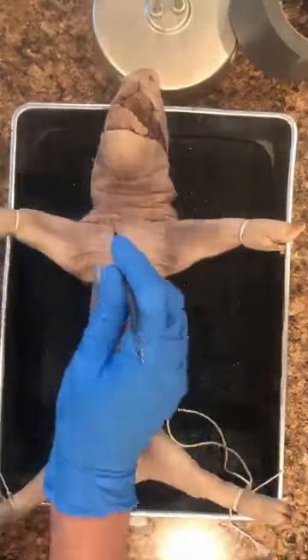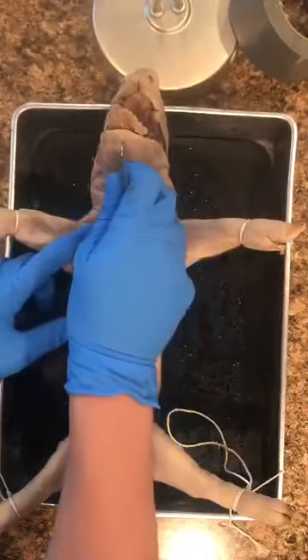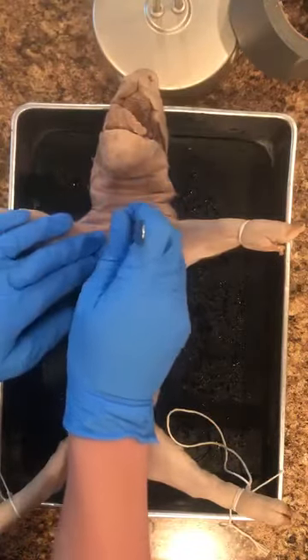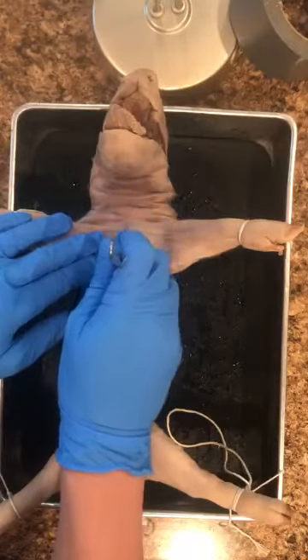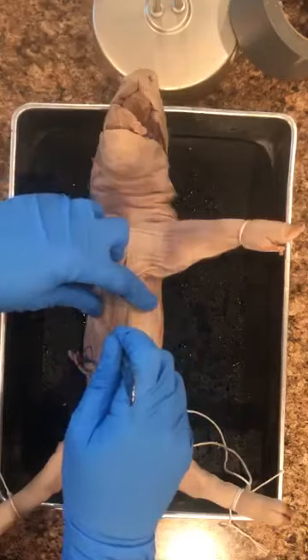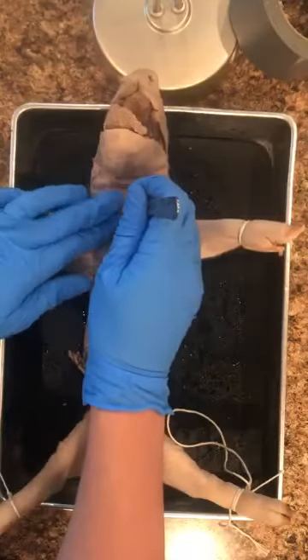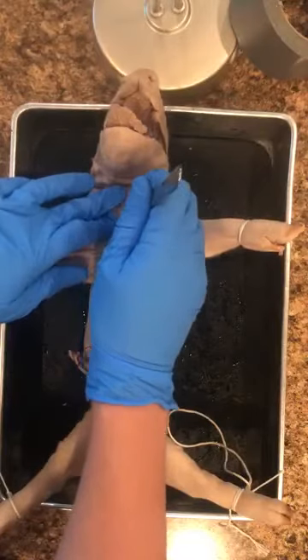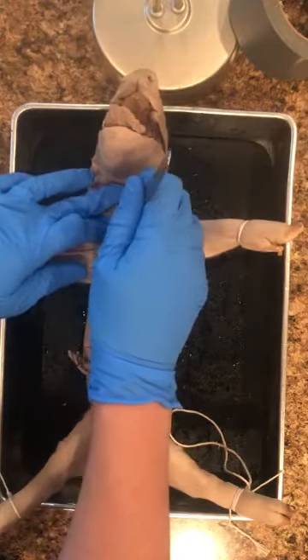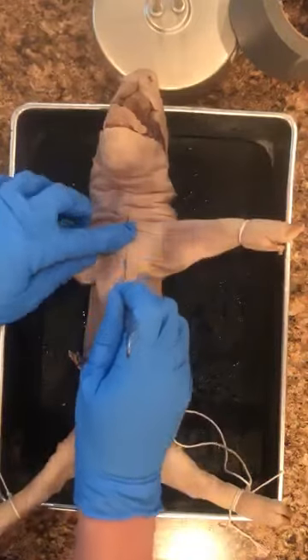Starting up here, I hope I'm all on camera. And I have to be very careful because I do not want to expose, or I mean I want to expose all the organs below, but I do not want to cut too deep and ruin any of the organs. So at this point, I have cut just through the skin. You can see there's like the layer between the skin and the muscle.